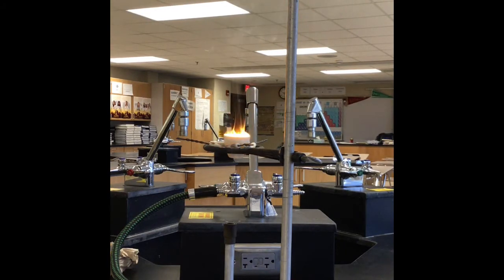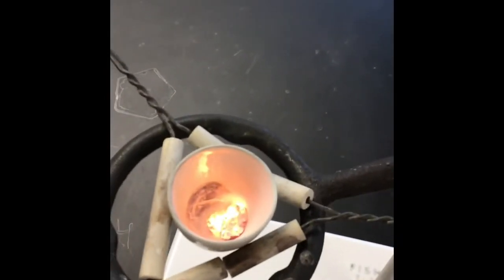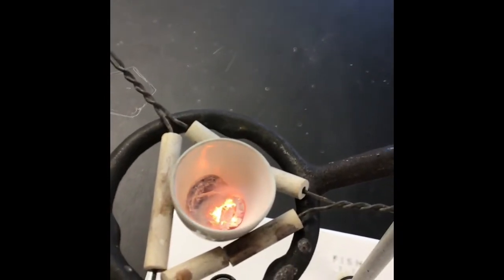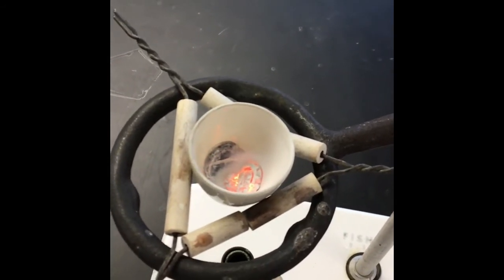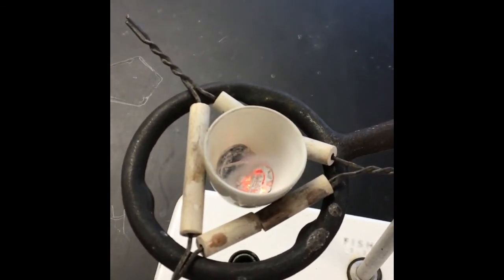If you blow over the top, it just gets it going a little bit more. And you don't want to look directly in there. It is very bright. So there you can see it. It's pretty much reacted now. Still glowing red hot, so you want to be super careful with that.